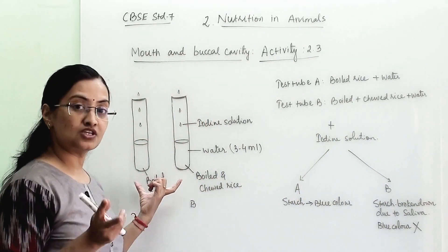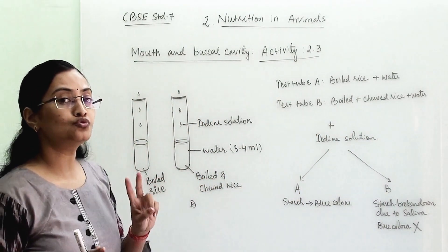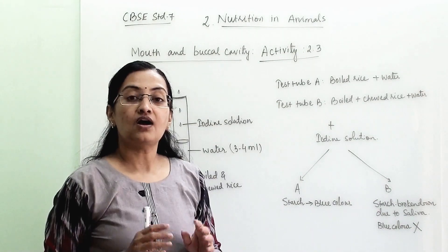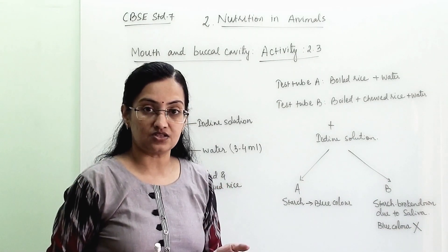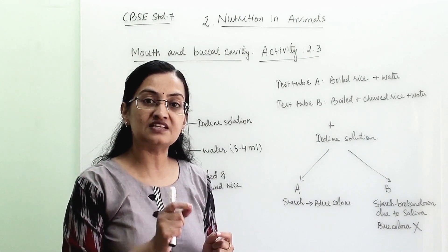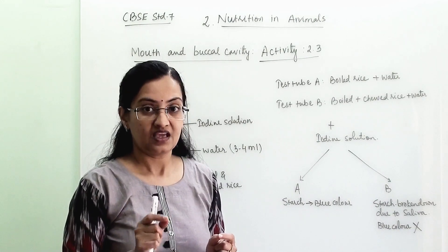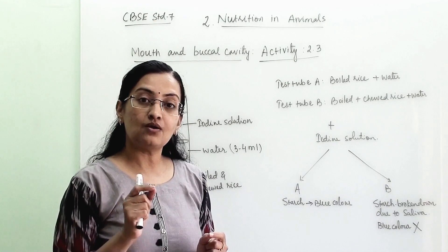Now after making these two test tubes ready, we are adding 2 to 3 drops of iodine. Now iodine is an indicator. Indicator will show a presence of one specific substance.